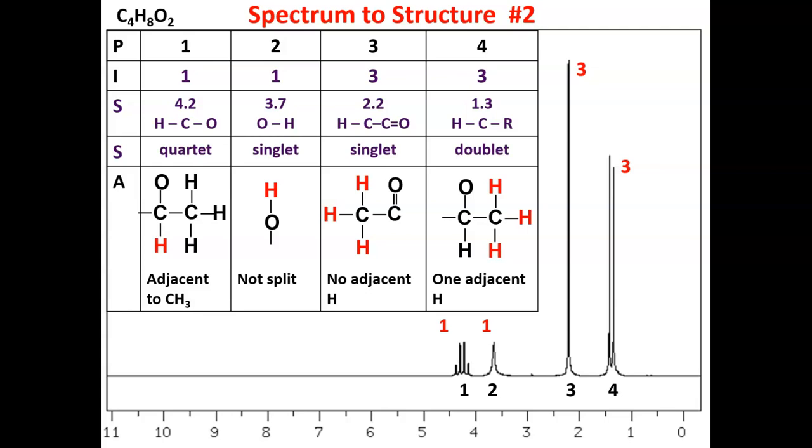So when we've got the 4 parts to this molecule, then we clearly have to assemble it into a recognizable structure. The information in the assignment makes use of the splitting pattern as well. So if we have a quartet, then we must have an adjacent carbon with 3 H's on it.